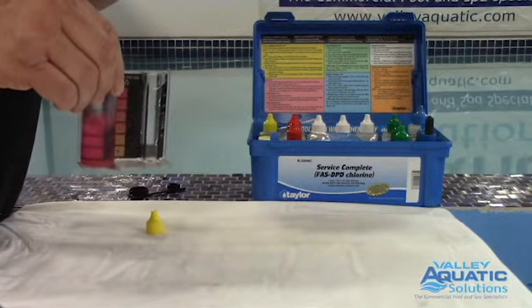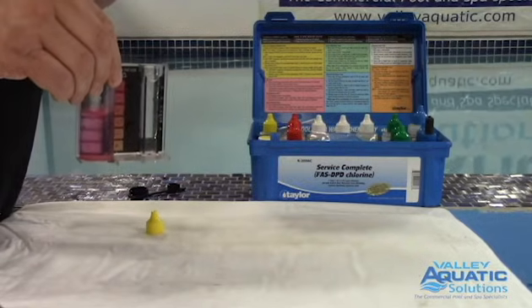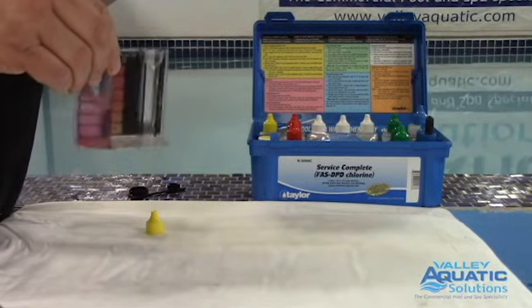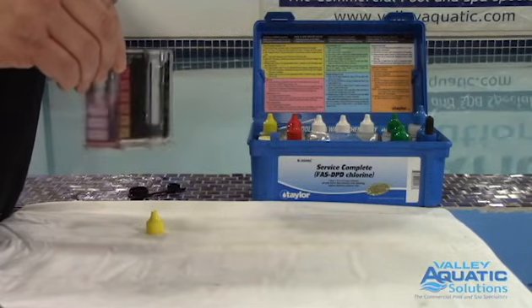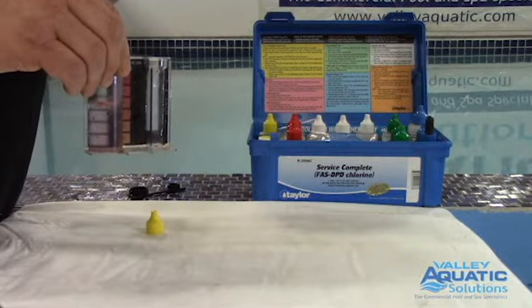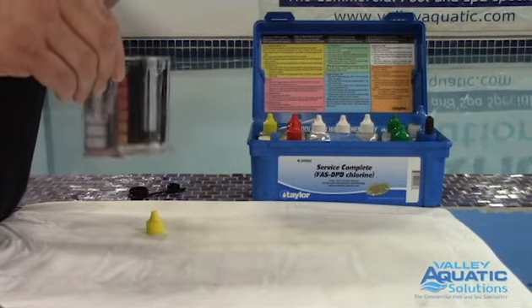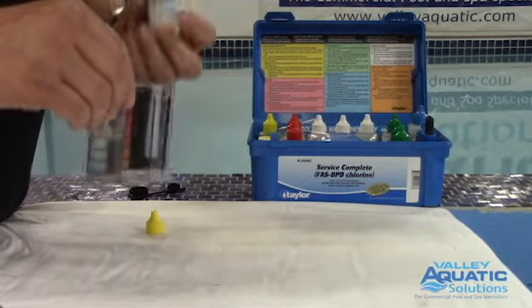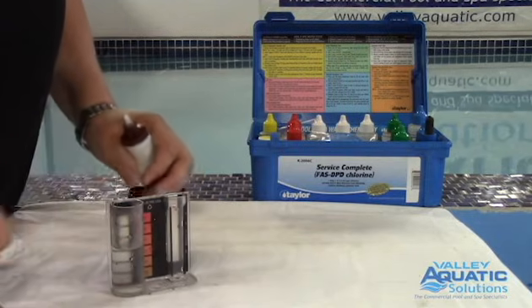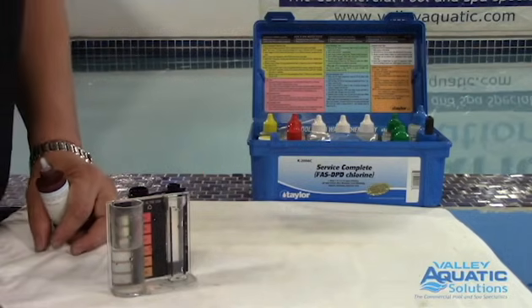I'm giving it a swirl and slowly putting drops in. I got five drops, then continued counting — at 20 drops it's lightening up a lot. At 21 and 22 there's still a bit of pink. Drop 23 — and when in question I always put another one, but I think 23 was enough. So 23 drops, multiplier is 0.2, that's 4.6 parts per million free chlorine.